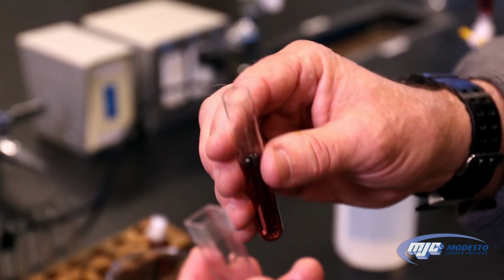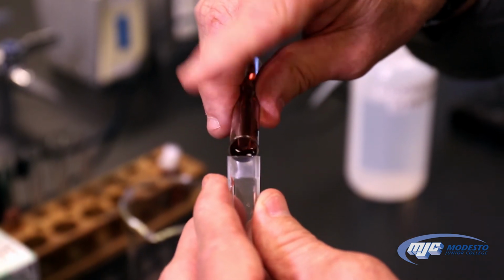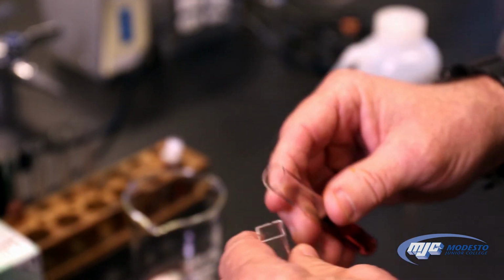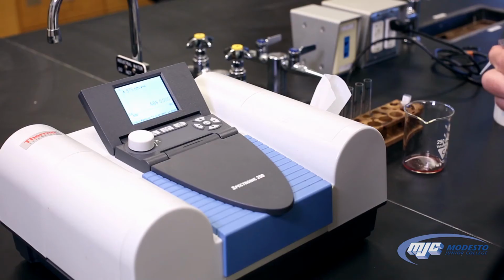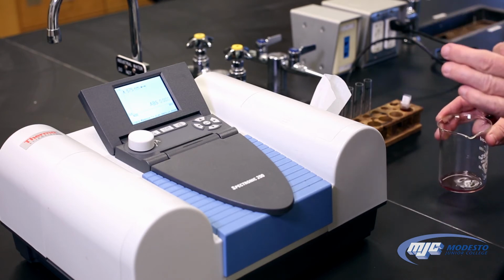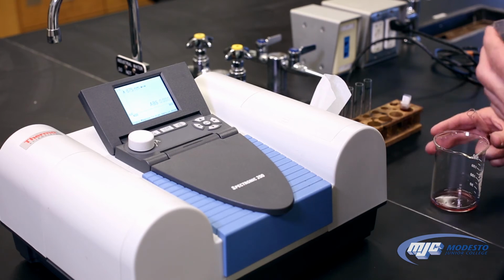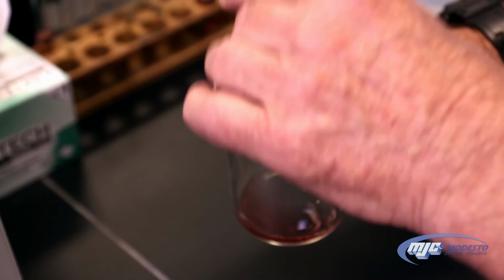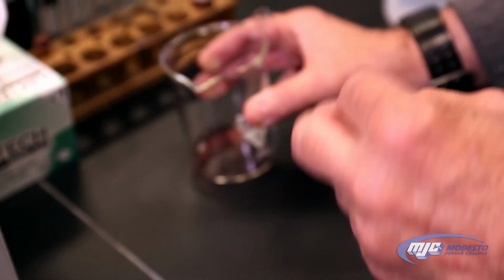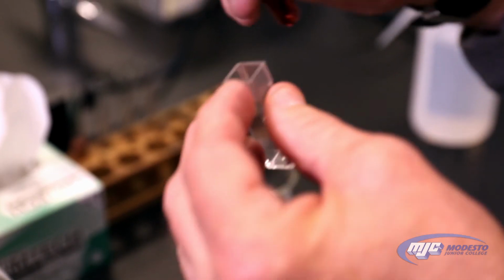All right, guys, so we're going to add a little bit of solution 5 to the cuvette. Condition it, basically. Give it a little swirl. And now we're going to have a waste beaker here, guys. We cannot throw any of this solution down the drain. Both the cobalt and the copper are toxic, not good for the environment. So we dump this into our waste beaker, which we'll put into a waste container at the end of the experiment. Now we're ready to fill up our cuvette with solution 5.